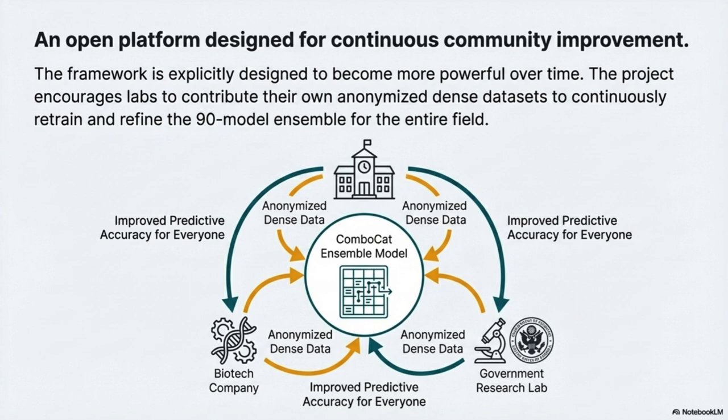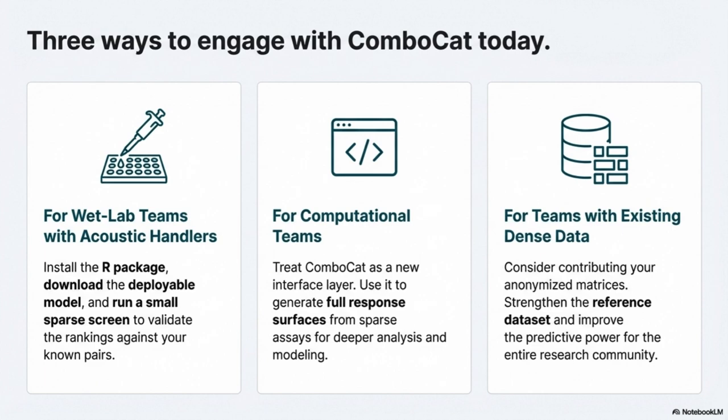Why is Loewe so much harder to calculate here than Bliss? Well, the Loewe model needs to find dose-equivalent effects between the two drugs, and that's just really hard to do accurately when you have sparse data. You might not have even measured the points you need. I see. Bliss, on the other hand, is just based on the expected product of the two single agent effects. It's much more robust when you only have a few data points. It becomes the practical default.